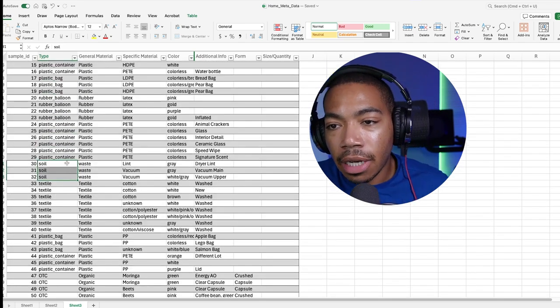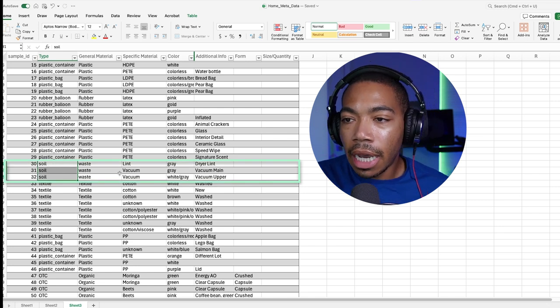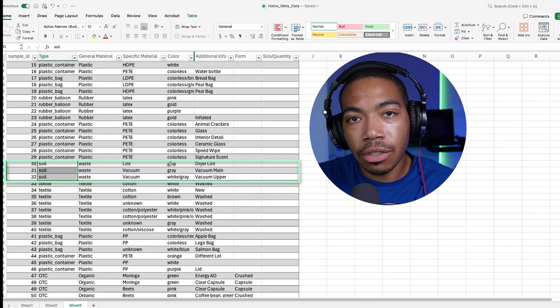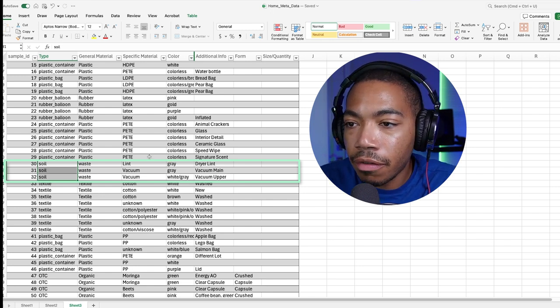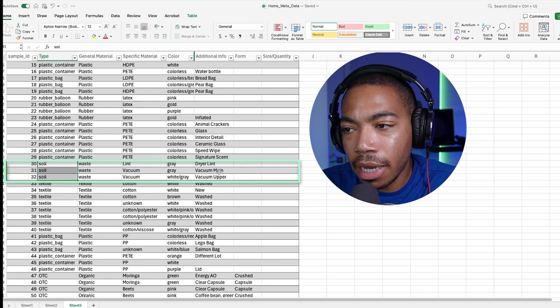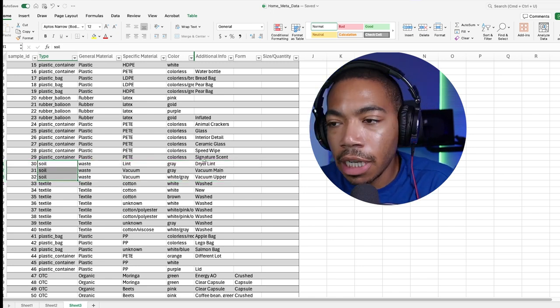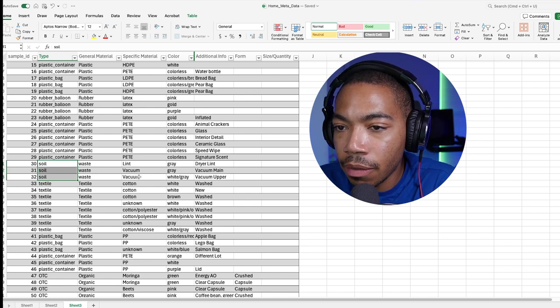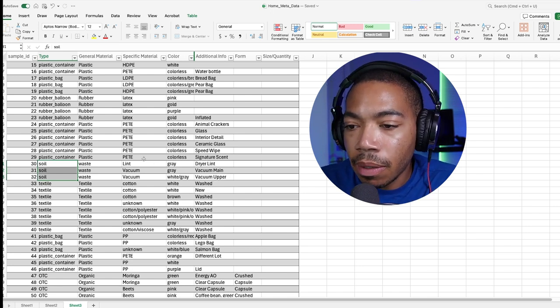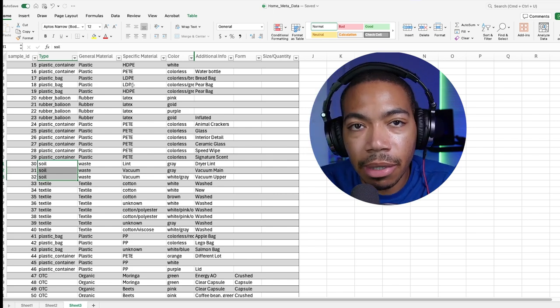And one of the areas that I was particularly interested in were the soil materials. And in particular, some that were from the dryer lint, so that trap that collects all the loose fabric pieces, and the vacuum. And we have a vacuum on the main level, which is primarily hardwood, so it's getting food that spills off the table, and our large area rug, and our upper level, which is all carpeted. And so as I was looking at the data to do the larger analysis, something kind of jumped out to me. Let me show you.